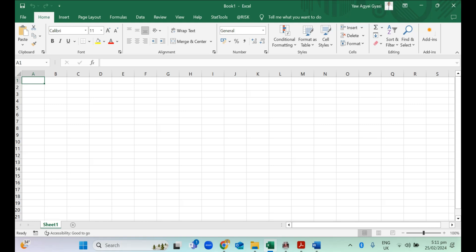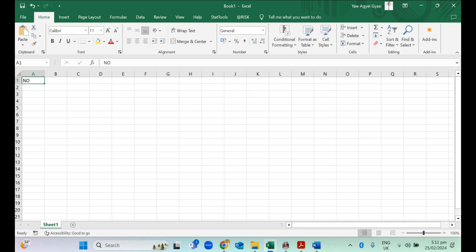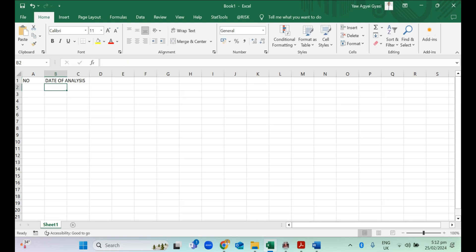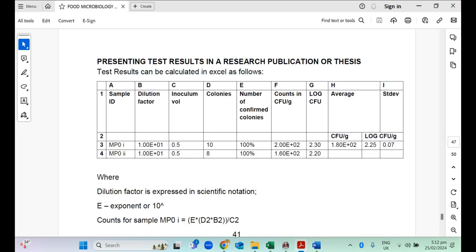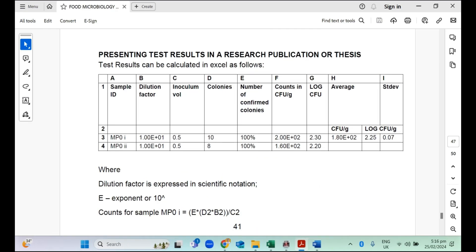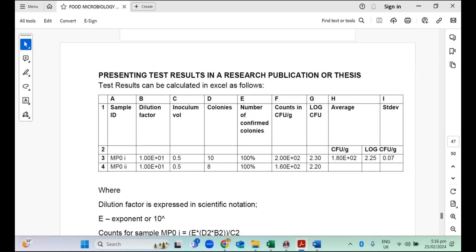This is basically how the results are presented. We are going to take this into Excel and then work on it. In Excel, supposing this is your lab notebook, you would have a number and you have the dates so that whatever experiments you do, you date them, the date of the analysis and you may want to add the date of the results in your lab notebook.